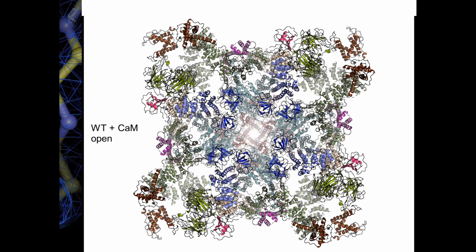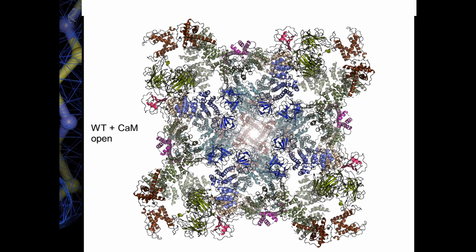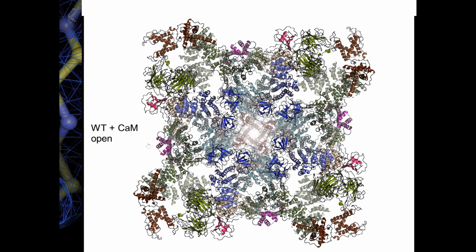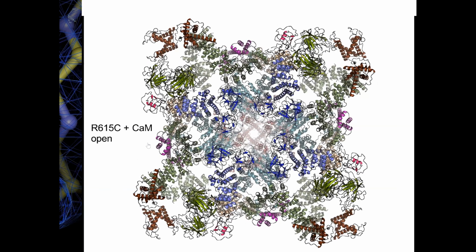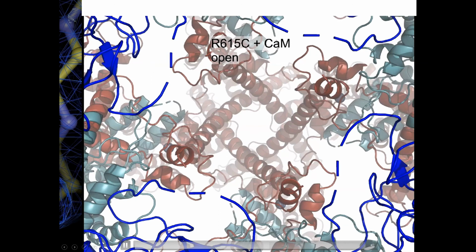Okay, now let's look at the open state. So let's toggle between structures of an open wild type and an open mutant. And I'm just going to show here the top view. And bottom line is that if you have a hard time figuring out what the motions are, that's okay, because the motions here are very subtle. And in fact, any tiny thing that you see here might actually just be explained by differences in resolution. So in the open states, there is actually very little difference between wild type and mutant.